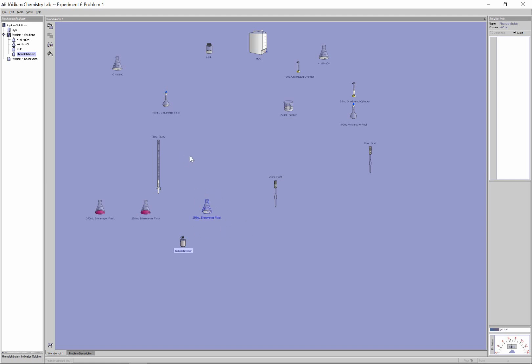Maybe I'll just do the last titration for you here. This time I'm just going to verify that I have phenolphthalein. Again, the actual amount doesn't matter. I'm just going to make sure that something is in there that can actually change color so that it can tell me when the endpoint is done. I definitely don't have enough volume in the burette, so again, I'm going to just load up from the burette, just something more than half again. Let's load up another 40 if I have it there. Hoping I have enough, so 21 maybe. So let's see if it's cutting it pretty close here.